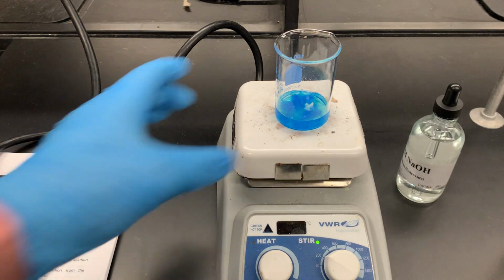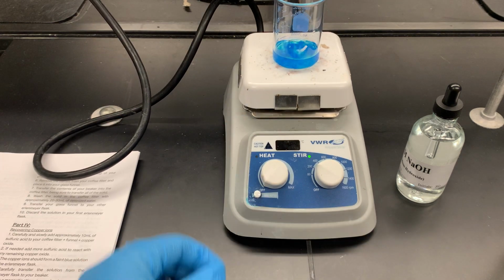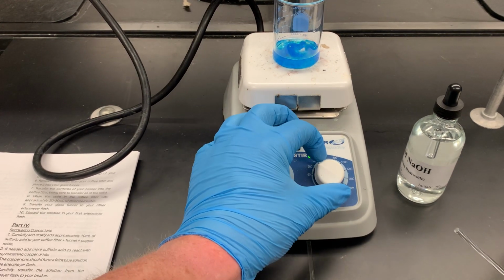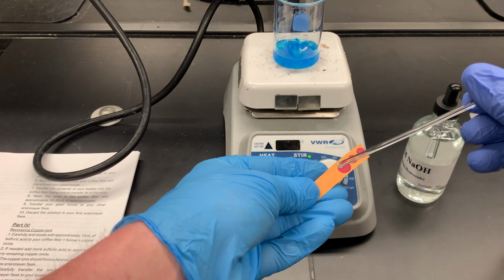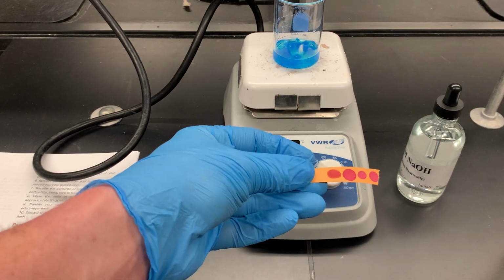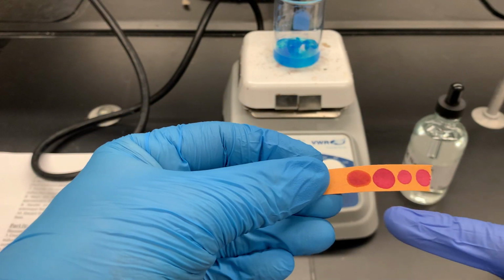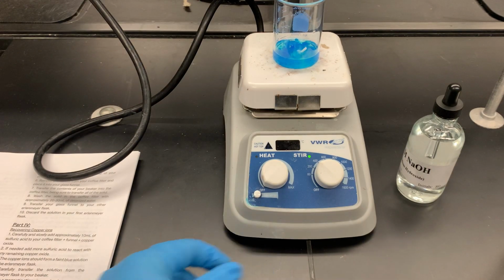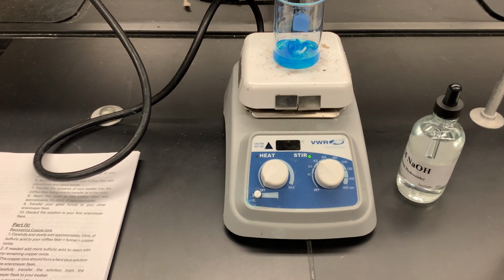So now I feel a little bit more comfortable checking to see if my pH has changed. I'm going to adjust my stir between 200 and 400, so a little bit faster than I had listed in the lab manual, but let's see. Okay, now this is very subtle, but this is a little bit less dark than this. So that means that we're moving into a little bit more basic environment.